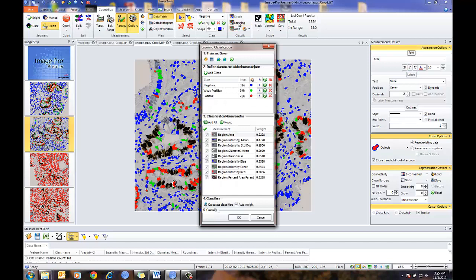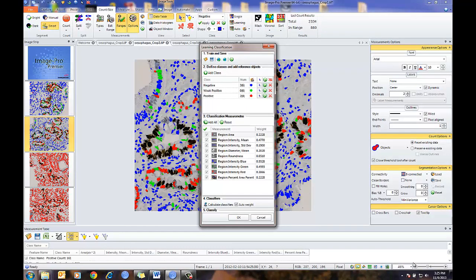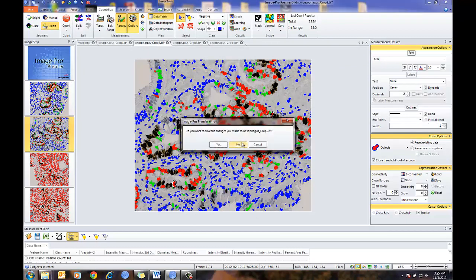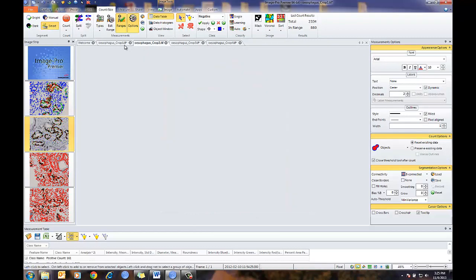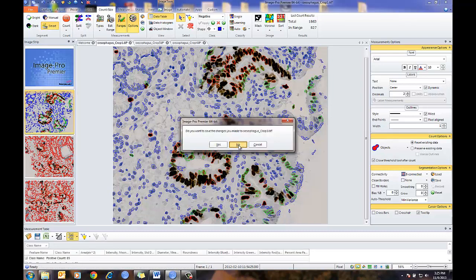The next step is I want to save this, so I'm going to press the Save button and give it a name. Just to show how this works — if I want to clear all this out, delete and reset everything, I can delete these, close these images, essentially starting fresh.